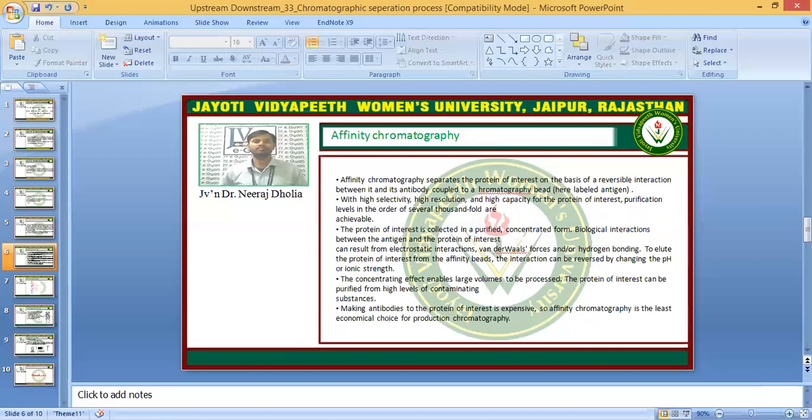In the stationary phase, if you want to isolate the antibodies, then you adhere the complementary antigens to the stationary phase, and if you want to isolate the antigens, then we coat or attach the complementary antibodies on the stationary phase. The solution, the mobile phase which has the complementary molecules, will flow through the stationary phase. While flowing with the mobile phase, the opposite antigens or antibodies will be captured in the stationary phase, and after attaching there, they will afterward be eluted out with a change in the pH or in the temperature, etc.